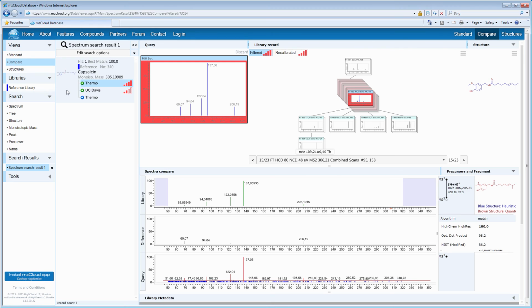Just one more thing. All you need is a modern mass spectrometer that will set you back a few $100,000.